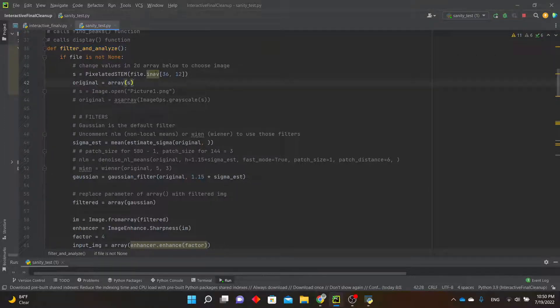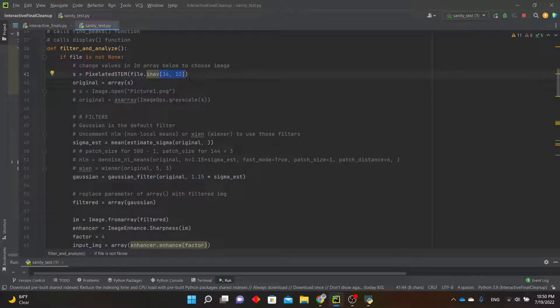The values in this array right here correspond to the dimensions of the block file, so you can choose which diffraction pattern you want to use.